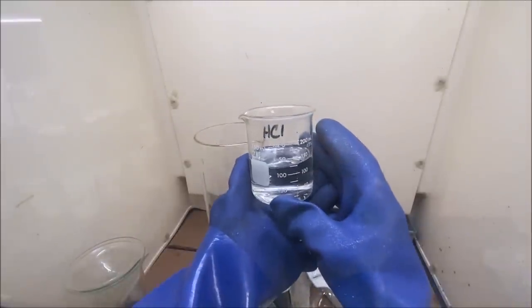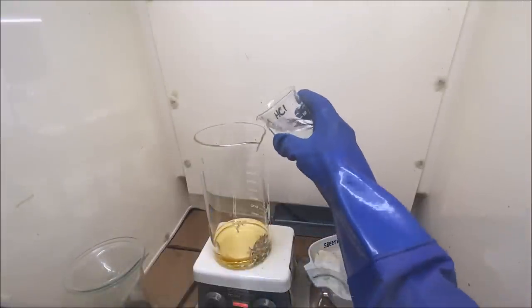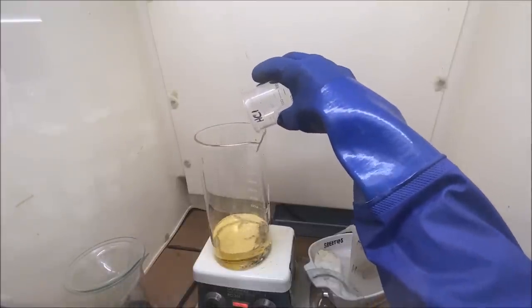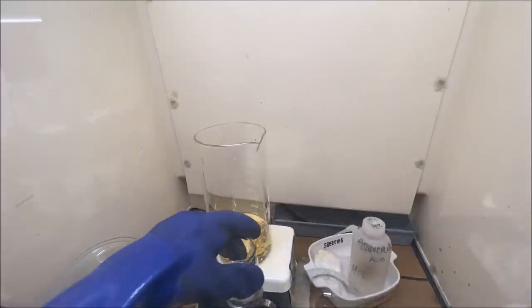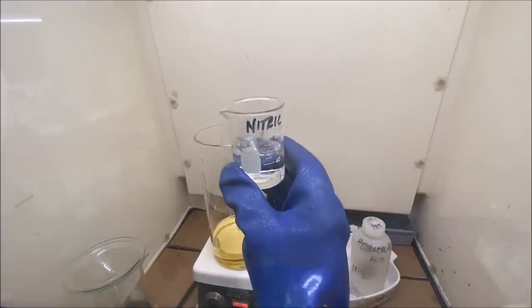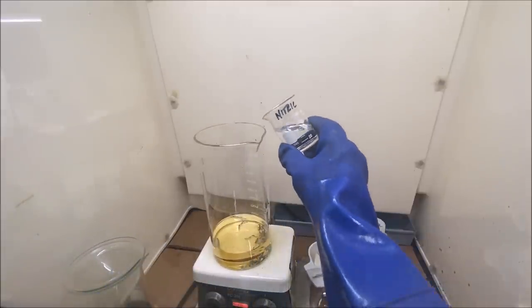Here I'm adding some additional hydrochloric acid. I think I put in a total of about 300 milliliters of the hydrochloric acid. And now we'll follow that up with another 60 milliliter dose of nitric acid.